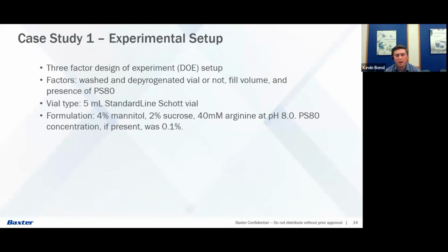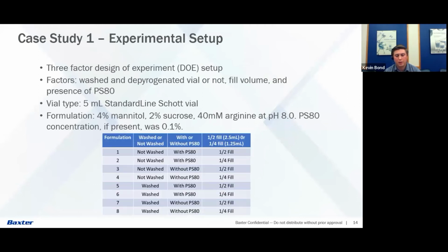So the full factorial formulation combinations looked like this in the table located below, where you have 8 distinct combinations for those three factors.